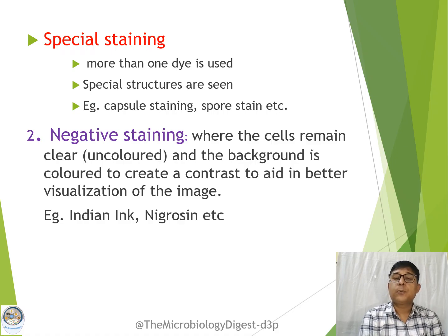Then spore staining techniques are different, and they come under special staining methods. So under positive staining, we have three types: simple stain, differential staining, and special staining.